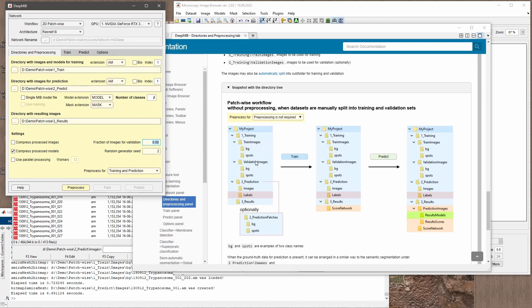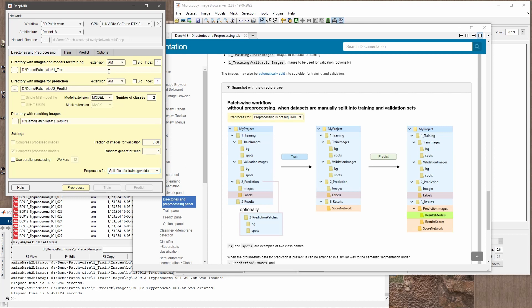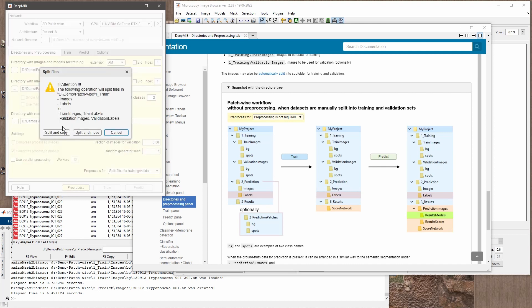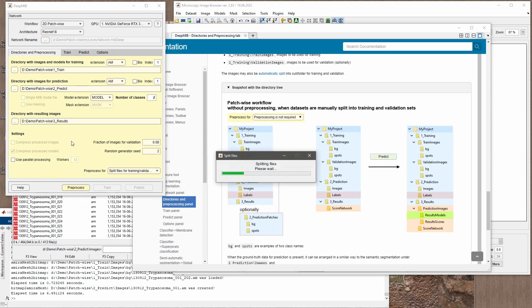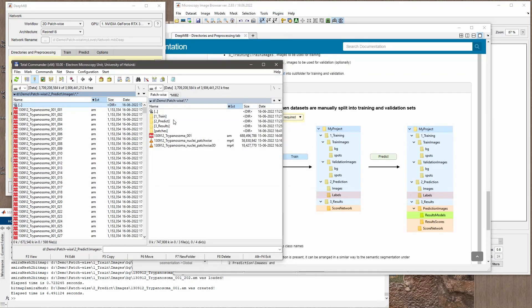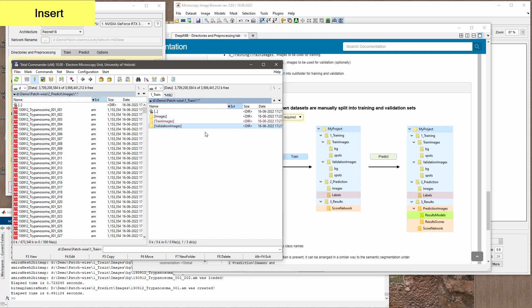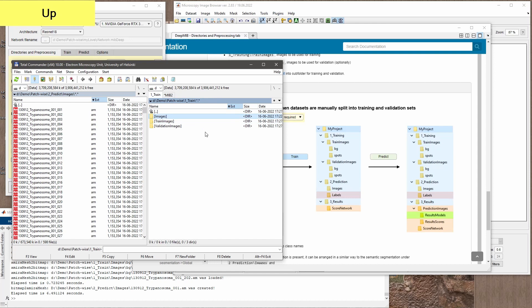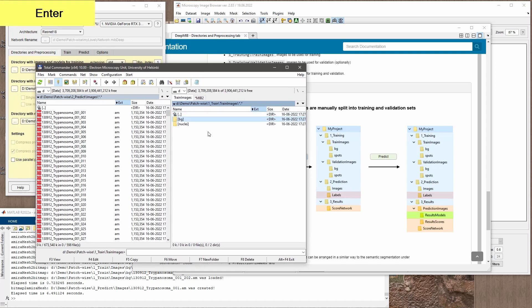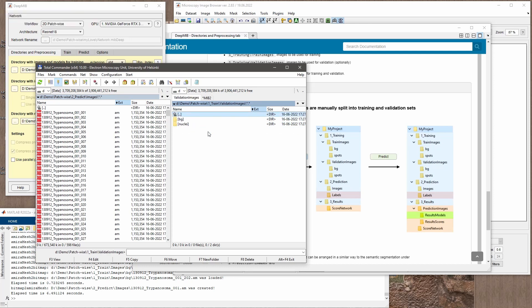The splitting can be done automatically by specifying the fraction of images for the validation images subfolder and choosing 'Split files for training and validation'. I select the correct file extension and press the pre-process button. We can either move or copy the files — if I copy, the original 'images' subdirectory stays. Roughly we end up with 92% of images in the train images subfolder and 8% in the validation images subfolder.